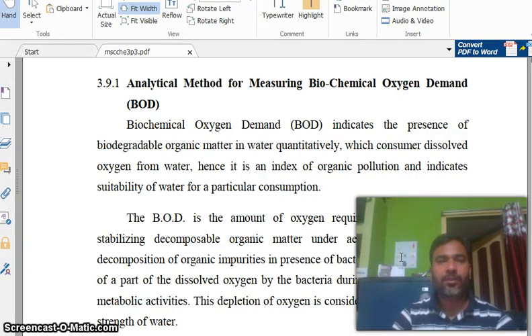In this video, I am going to talk about analytical method for measuring biochemical oxygen demand. Generally we call it BOD.